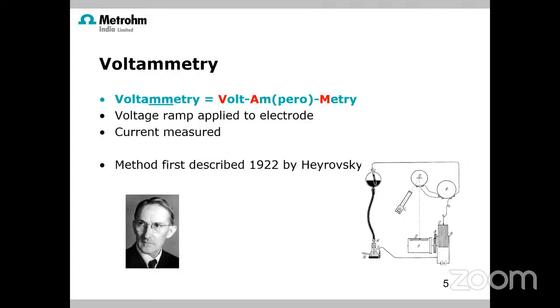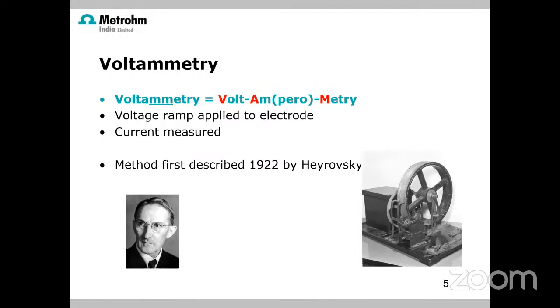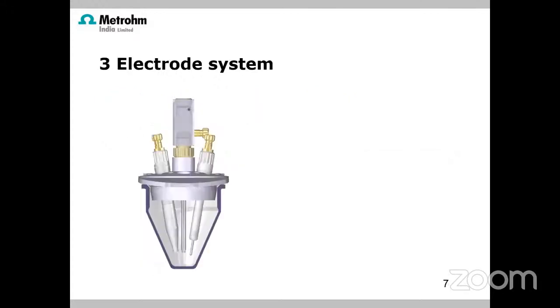This was first described by Heyrovsky from Eastern Europe. He is the man who found this technique. Probably in college you must have seen a pool of mercury, with mercury coming from the top through a tube into the polarograph. Polarography you must have heard a number of times in your college days. That is something similar to this, and we have new instrumentation for it. That was the first instrument, brought about by Heyrovsky, and he got a Nobel Prize in 1959 for this technique.